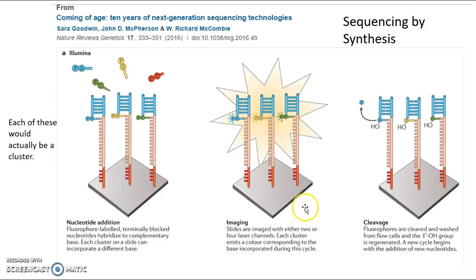But in fact, in Illumina technology, you will have little clumps of this called clonal clusters, and then at a different spot on a physical location called a chip, you would have a little cluster of this called a clonal cluster and a little cluster of that, so that you can image the total layout and see little clumps that are telling you that an adenine was added here, and then nearby there'd be another little clump that was lighting up with the guanine color, and close to that another little clump that was lighting with the C color.